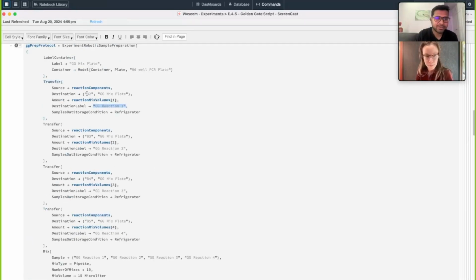So the reason I'm selecting my own wells is first to avoid any edge wells. If you don't specify anything and just specify the plate, I think the default is going to use well A1 if it's available. And that's pretty close to the edge of the plate, and whenever somebody puts a lid onto the plate and removes it, there might be a case where the sample could be disturbed, or it could also evaporate. There are chances of it getting evaporated. So it's better to use a well that is somewhere in the middle of the plate. Yeah, edge effects are real and to be avoided.